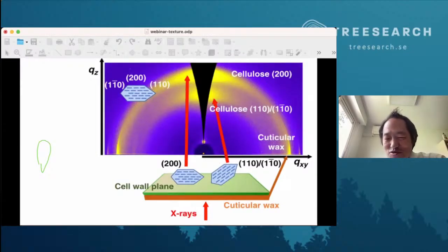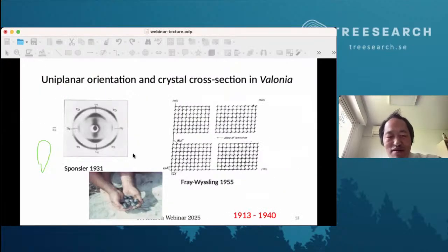So I wrote to them that they should retract this paper because this is completely wrong. And the reason why it's wrong, you can just see: if all the fibers are aligned, you're looking only at the section. But even in this case, if you had this kind of crystal, then the 1-10 diffraction should point to this direction. So you should see diffraction here, which you see, but only faintly. So if you had the dominant diffraction like this, you should see a combination of pattern like this. When you have a strong alignment of this one, the other peaks should appear in different directions.